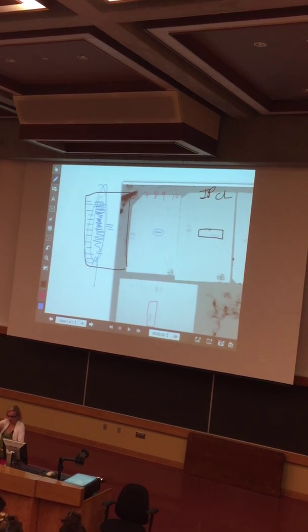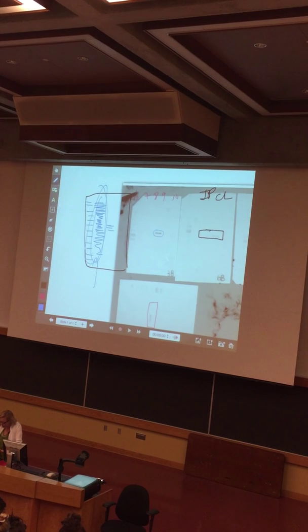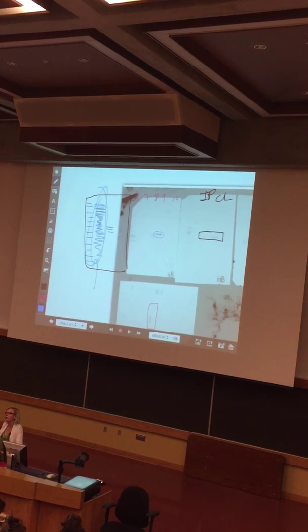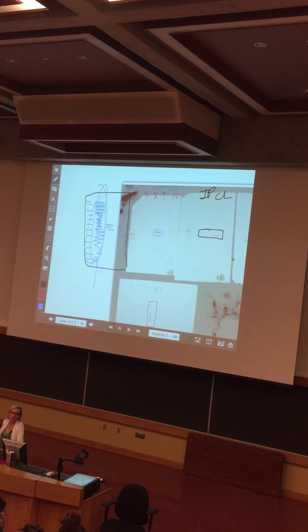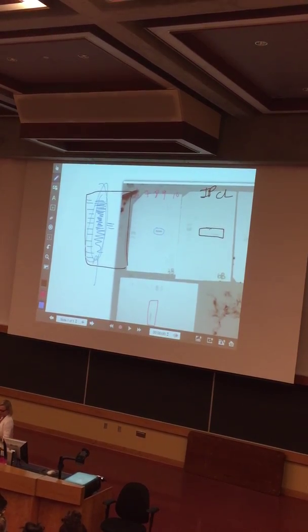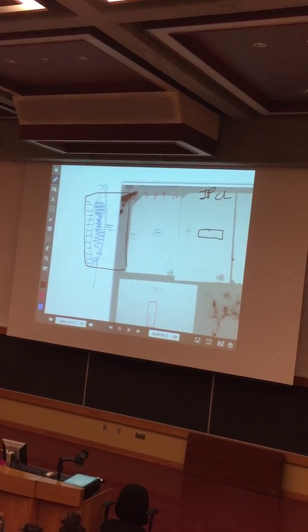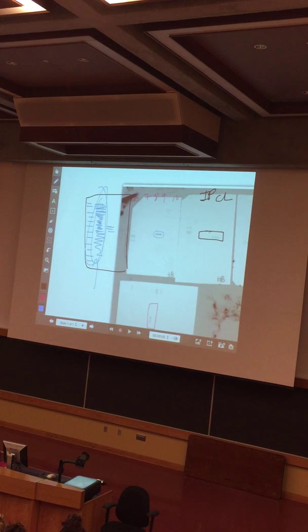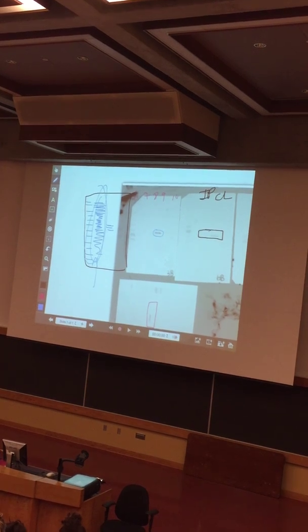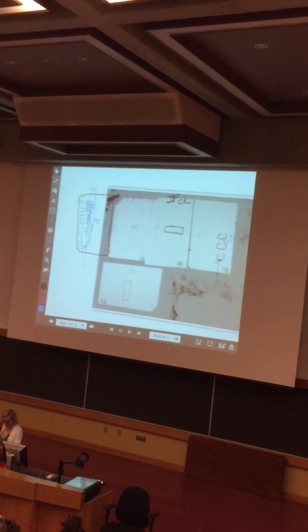You have your antibody incubating, you have your washes, you have your immunoprecipitation, of course, itself. Many of you ended up either having insufficient washes in the IP, in which case the IP will be very dirty, so lots of protein there, or doing the opposite, which is actually losing a lot of proteins, washing too vigorously, right? So there's a fine balance there. But in any case, that's as far as it goes.